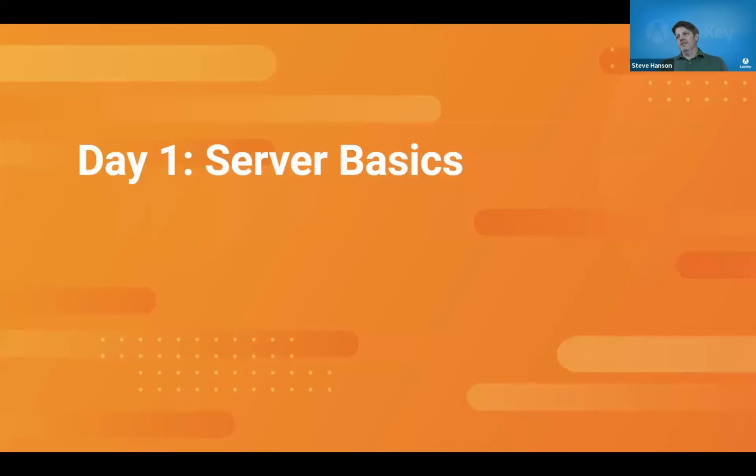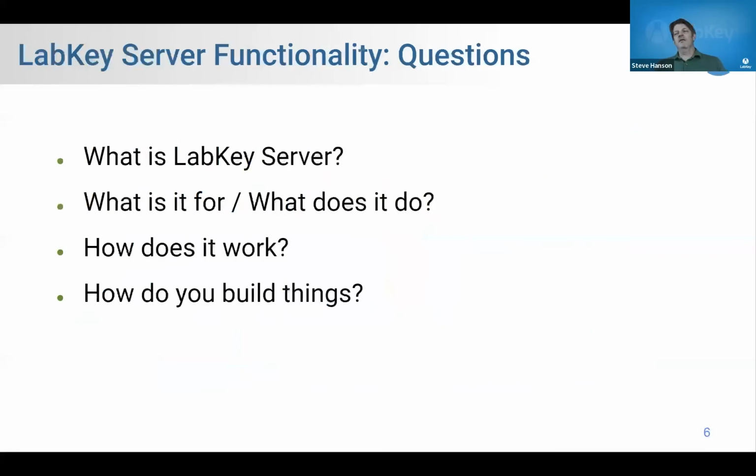So anyways, day 1: server basics. This is a presentation I give for people that don't know anything about LabKey, that really don't know the first thing about it other than there's this thing called LabKey Server. What do I do now? In this presentation, I try to ask the simplest questions I can imagine. What is LabKey? What's it do? What's it for? How does it work? How do I use it? How do I build stuff with it?